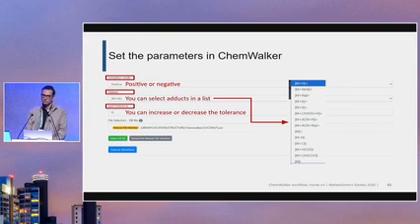Of course, you can do that directly on the job, but just for the visualization, because it's a little bit lighter on the server, I think it's 100 or 1,000 for the threshold. You're going to see almost everything, and then you set a higher one depending on the instrument or the specific molecular class you want to look at.